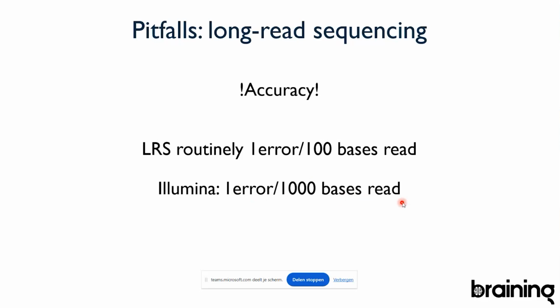Of course, this is a very raw readout, so that would be really the biological reality of what happens. And then with bioinformatics and with making a consensus sequence, you would be able to get this error rate down, right? However, if you use long read sequencing, the error margin is 10 times higher.